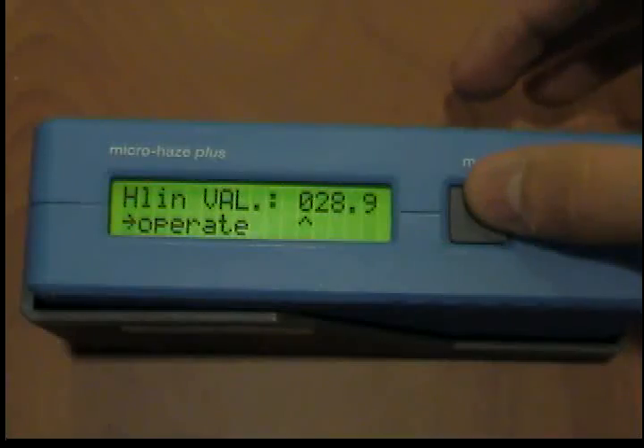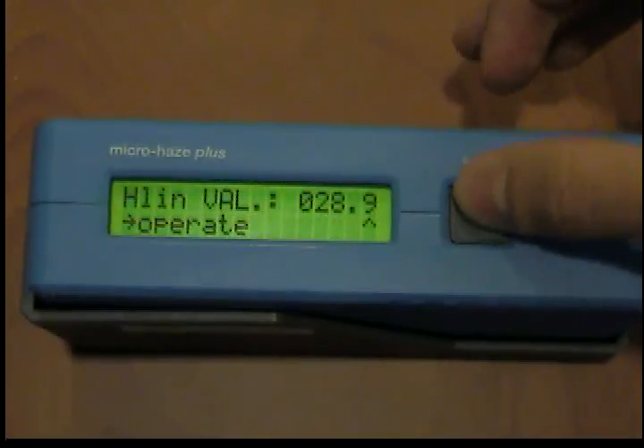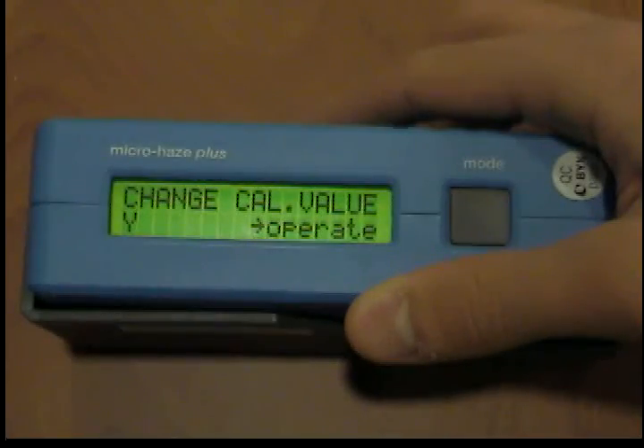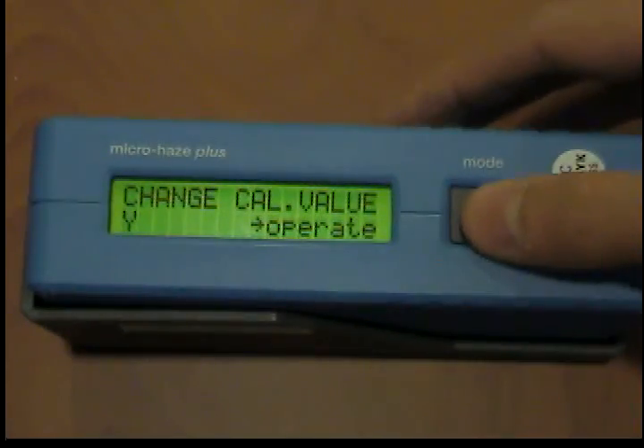New start. In case you want to restart the changing routine because of an incorrect entry, wait until the device switches off automatically, then start again. After having successfully completed the new entry of calibration values, the measuring unit must be calibrated with the new standard.